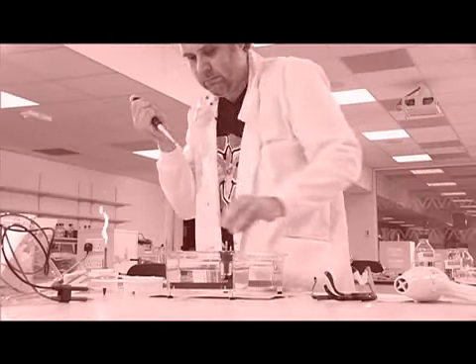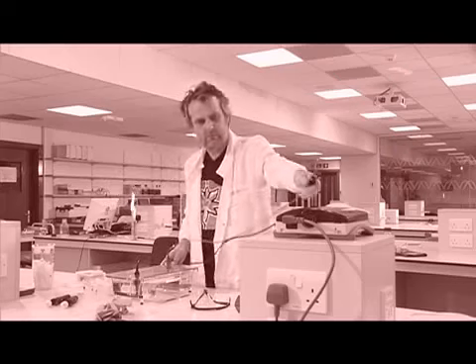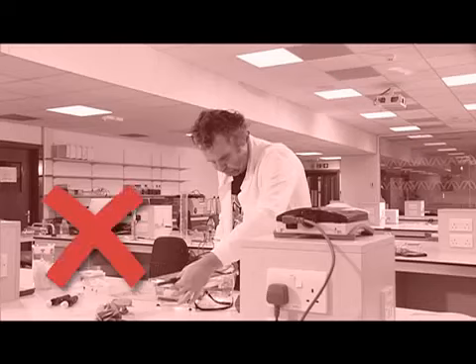Another mistake that can be made when loading a gel is to load the sample too quickly. This will also cause the sample to flow out of the well. Once you've loaded your samples, take care not to move the gel. Even a small movement can cause sample loss and contamination.